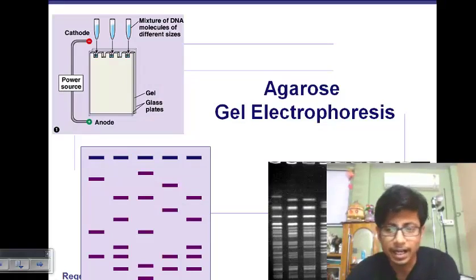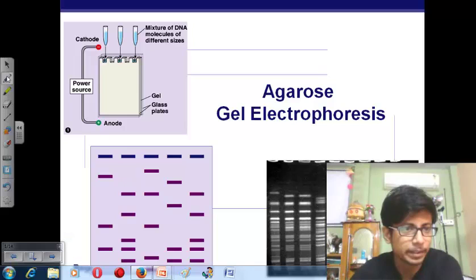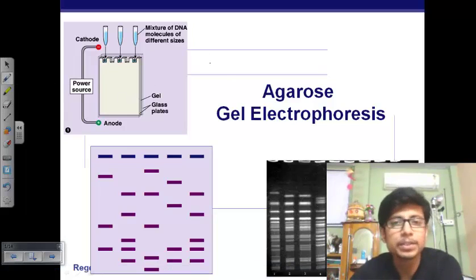Friends, in this video tutorial we'll be talking about agarose gel electrophoresis. We have seen the different types of gel electrophoresis out there: agarose gel electrophoresis and polyacrylamide gel electrophoresis.